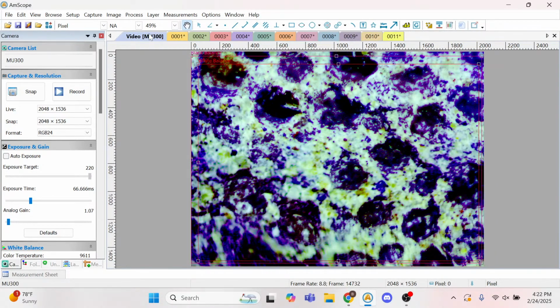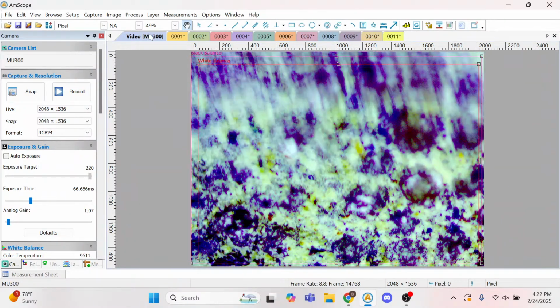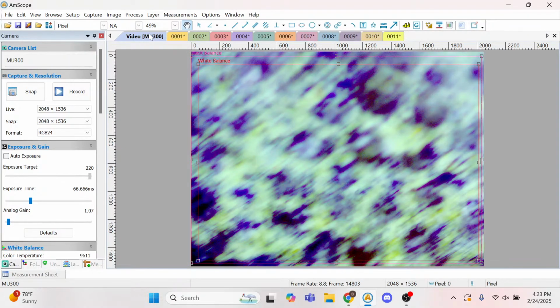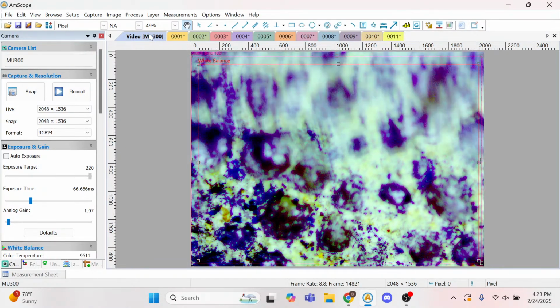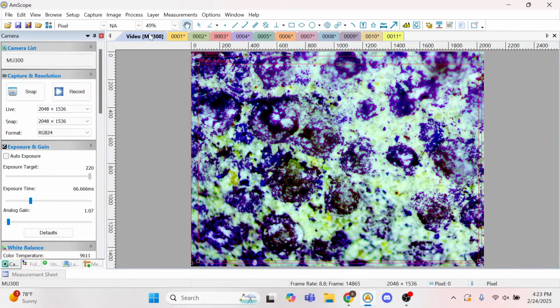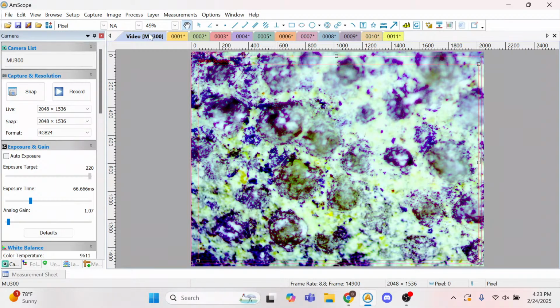Welcome to the stream. I'm just wrapping up photographing this fragment of a sauropod long-necked dinosaur eggshell, and I'll move on to a piece of theropod eggshell, which are the carnivorous dinosaurs.